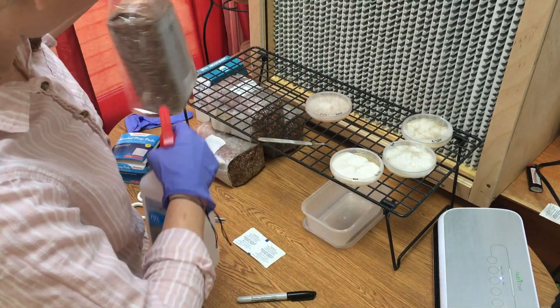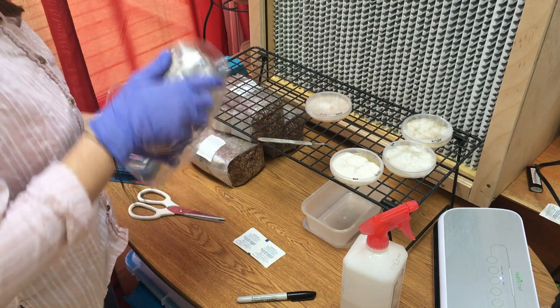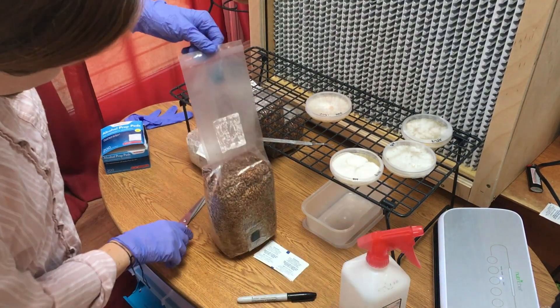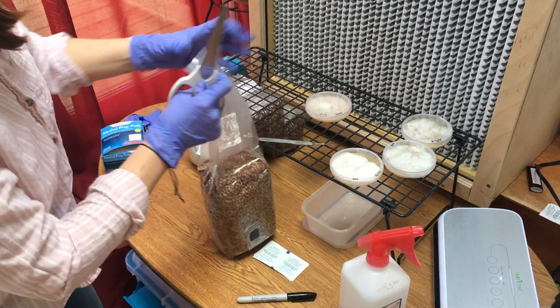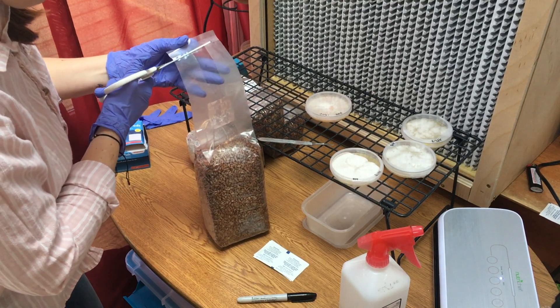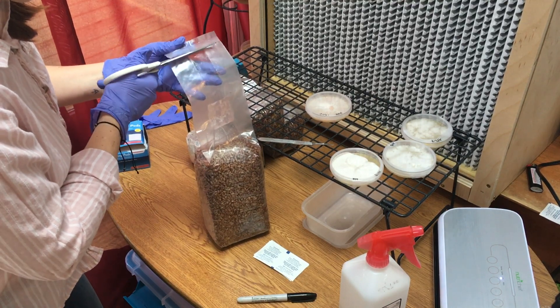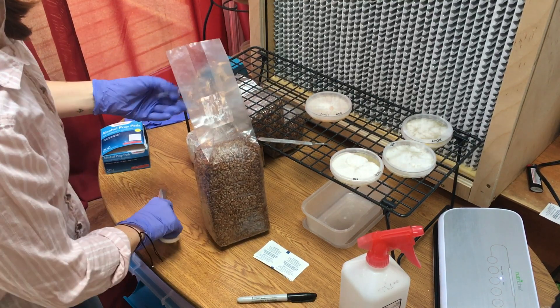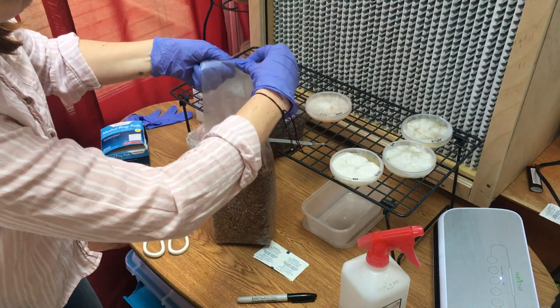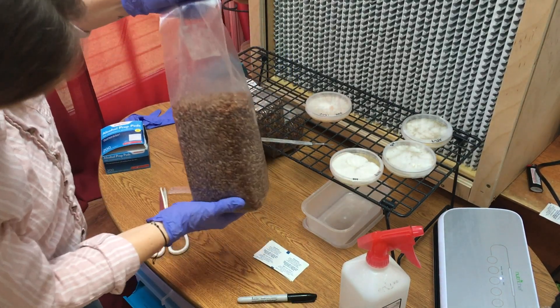I am using a pre-sterilized spawn bag that I got from Spawn Magic. These bags are great quality at a great price. When you first get these bags, they are tightly sealed and hard to mix. Before I inoculate them, I like to give these bags a quick mix. An easy way to mix them is just carefully cut the top, add some fresh air, then fold over the top, shake the grain, and mix the bag.